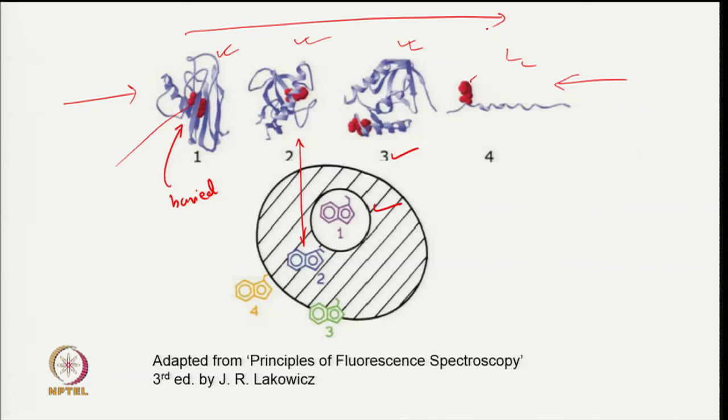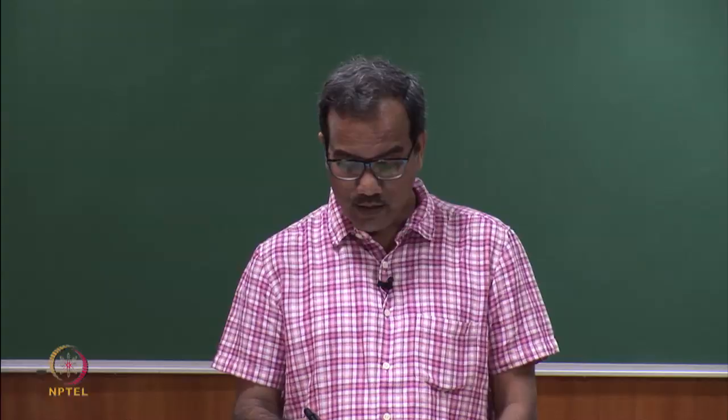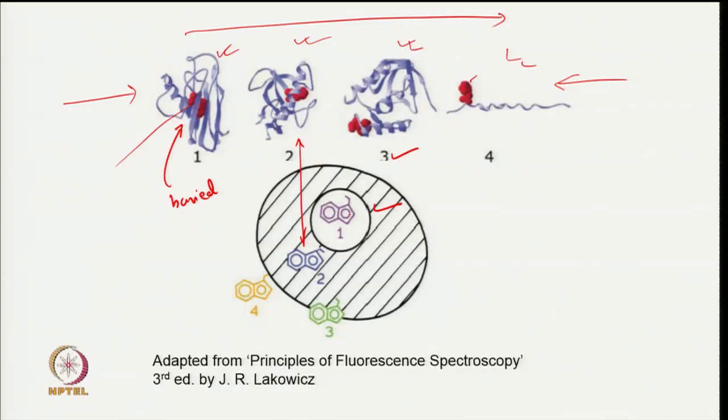Now, you can think of this as akin to tryptophan being in a hydrophobic solvent when you talk about conformation 1. In conformation 1, tryptophan is completely buried, so it is surrounded by a hydrophobic environment.